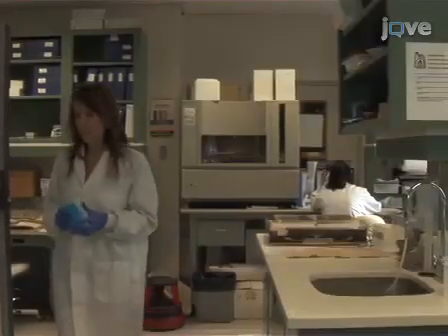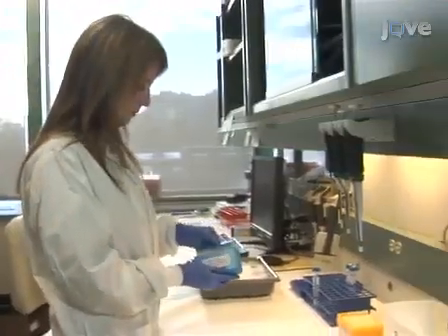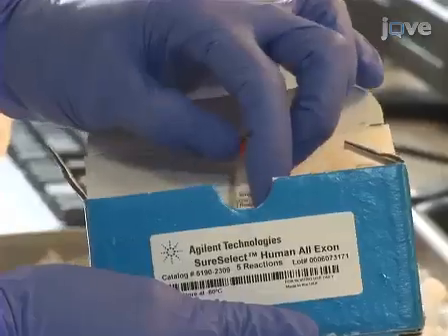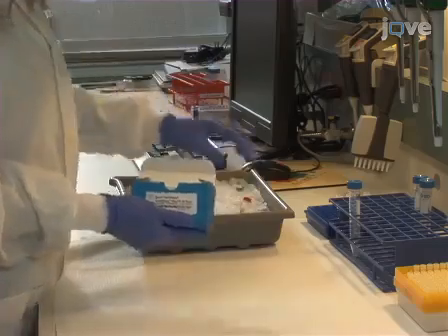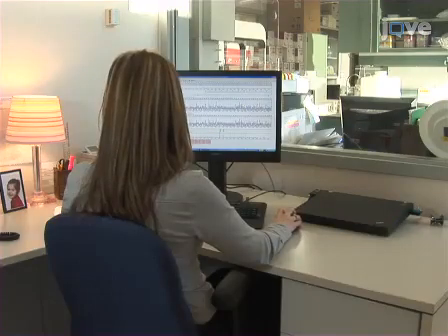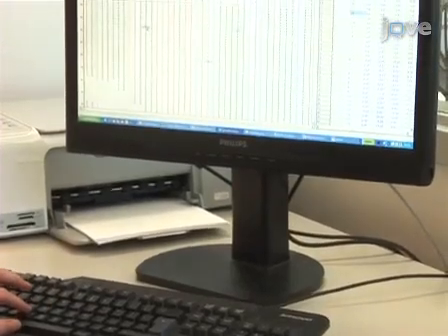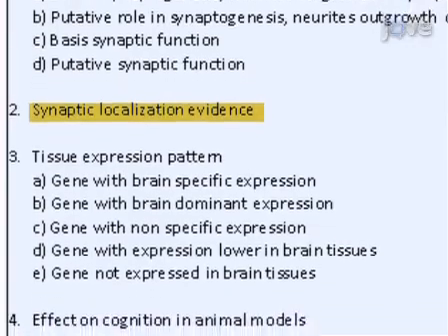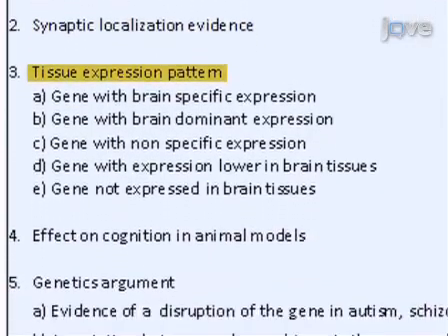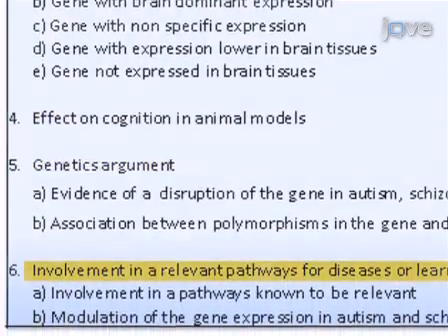A powerful alternative to sequencing selected candidate genes is to use high-throughput sequencing to sequence the coding regions of 16,000 genes. Kits are now available to prepare samples for whole exome sequencing from various commercial companies. When these sequences are returned to the lab, there are several bioinformatics tools for detection and genotyping genomic variation to choose from. Now, before prioritizing mutations within the whole exome, select variants from ranked candidate genes as explained earlier.